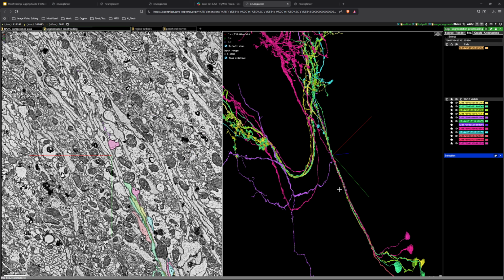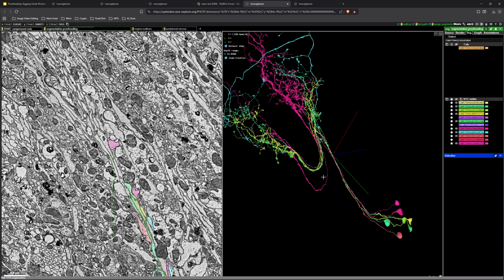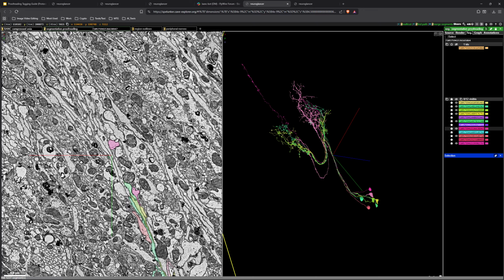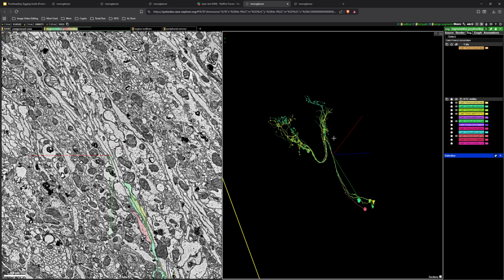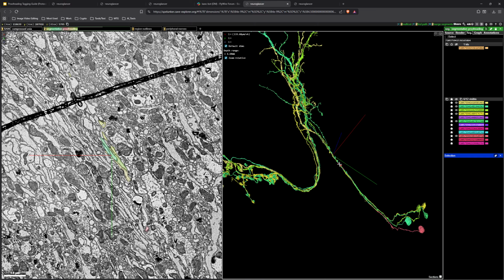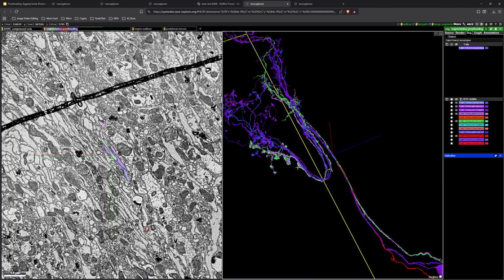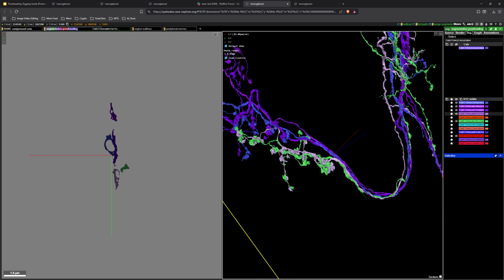all right, and we're only going to keep ones that have their soma in the same place as this one and are not extremely different. So this teal one's too different. That one's too large. This one's too long. So here we have some cells that look basically the same as our cell. As you can see, there's one type here that sort of synapses in this location, and another type that has more broad arbors that synapse further up.